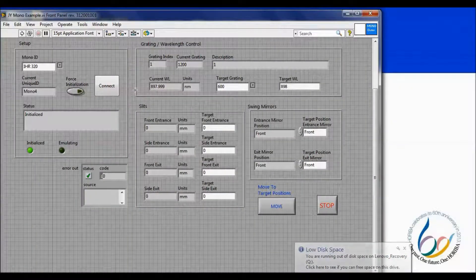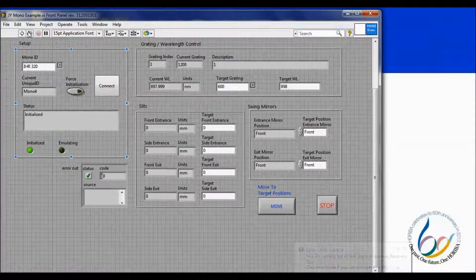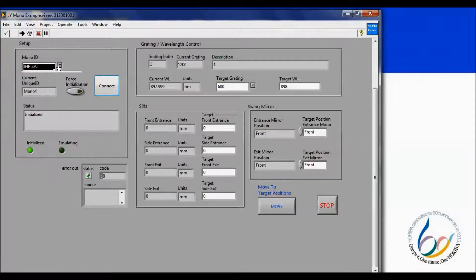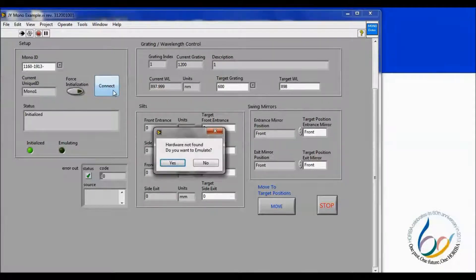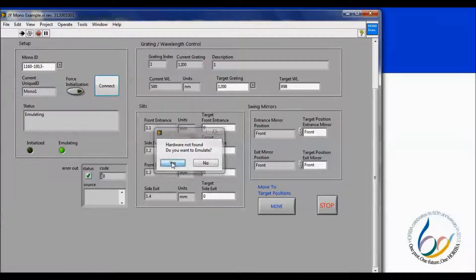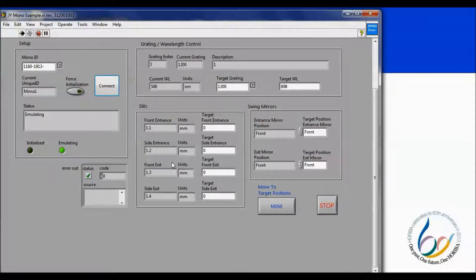If we now go back to the example VI, we see a user interface where we may choose our spectrometer and initialize. Here I am going to be emulating since I am not physically connected to a spectrometer. The spectrometer will then initialize and the grayed-out boxes become populated with the current grating position, wavelength, slit widths, and mirror positions.